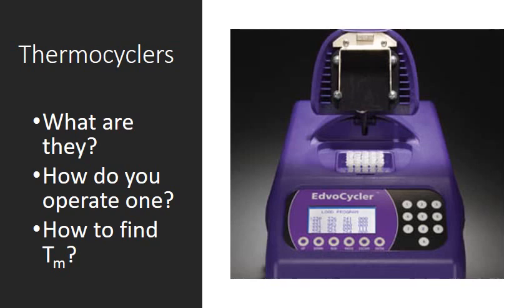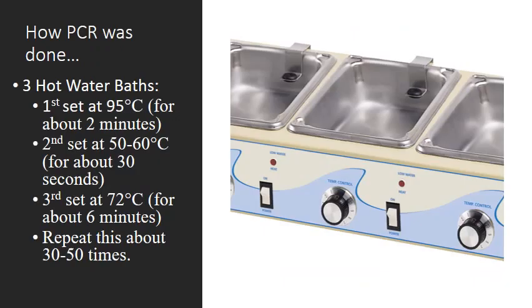So what are thermocyclers? How do you operate one? And how in the heck do you find the annealing temperature? All right. Let me give you a backstory about how we used to do it back in the day. And this was really frustrating.